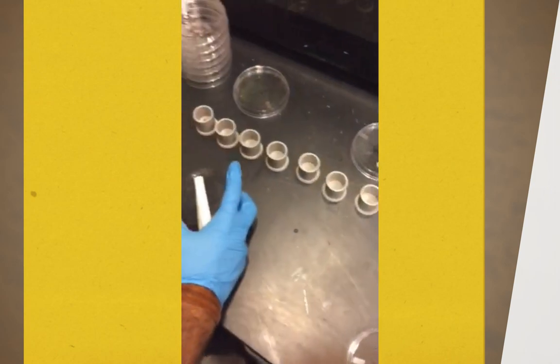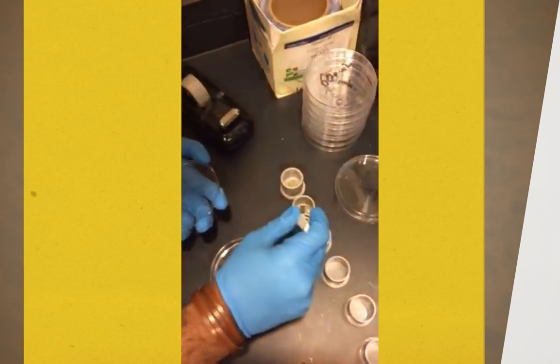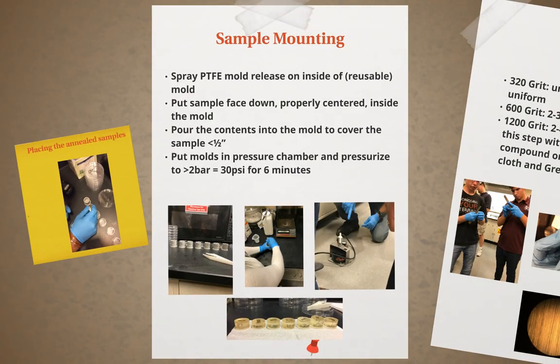While preparing the reusable molds, the epoxy resin will be made by mixing a cold curing resin powder with a liquid cold curing resin in a small cup. The epoxy resin is formed and ready to use in the molds. Pour about half an inch, or enough to cover the brass sample, into each mold. Once each container is filled with the appropriate amount of epoxy, the molds are placed into a pressure chamber to harden the resin around the cartridge. The molds will stay in the pressure chamber for 6 minutes each, reaching around 30 psi. The molds will be hot when the time limit has been reached, so let them cool before trying to take out the solid epoxy brass sample.